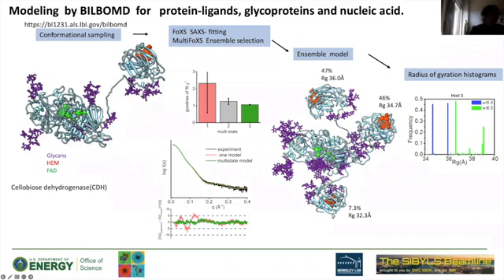The models that have been selected using MultiFoXS have a higher Rg, which allowed you to say that. You can see this already in the P(r) function. You can see it in relative distributions, but this is additional information on how those domains are really separated.